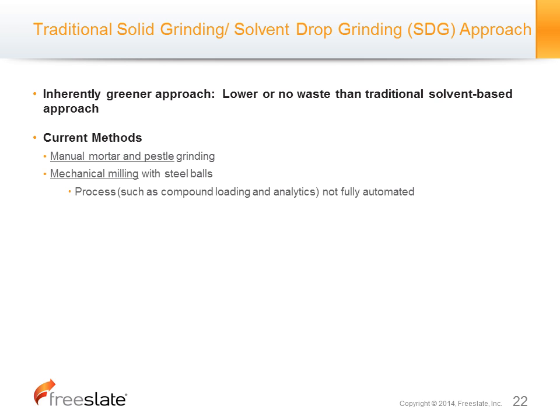Currently the method is truly manual, which is you can do manual mortar and pestle grinding. It's truly just you grind it. That's actually the test case we did. And there are definitely more mechanical milling approaches with steel balls. I think you can set up multiple wells as well. I haven't seen it personally, but the potential problem with this approach is that the milling part is very efficient, very great, but the compound loading and the analytical part are not fully automated yet. So you definitely have a part you have to do manually.